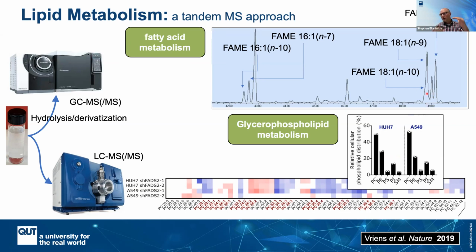So this is a really strong example of where the disconnect that we have in the toolbox of lipidomics doesn't allow us to connect one bit of metabolism to another to see where that's actually connected. And so I guess that's the gap that we've been trying to bridge, to see whether we can bring new technology that can make that connection and present a fuller picture of the metabolism, but perhaps even discover new molecules and new metabolism.